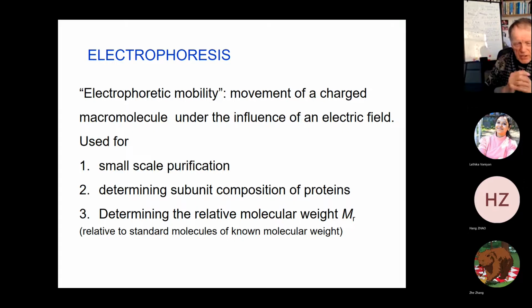Of course, the end residues will be charged, the amino end and the carboxylic acid end will be charged, so long as the pH is not too acidic or not too alkali, then both ends will be charged.